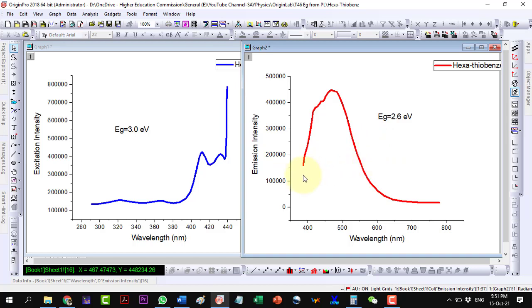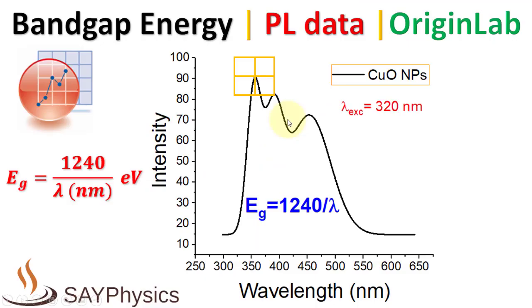It is to be noted that the bandgap value from the PL data critically varies from sample to sample. For some samples, excitation spectrum data proves to be more accurate, while for some the emission spectrum data. This is due to the fact that PL spectra depend on the status of the sample, like defects, impurities, dopants, and the contribution of the non-radiative energy transfer to the actual radiative energy that is measured by the device.